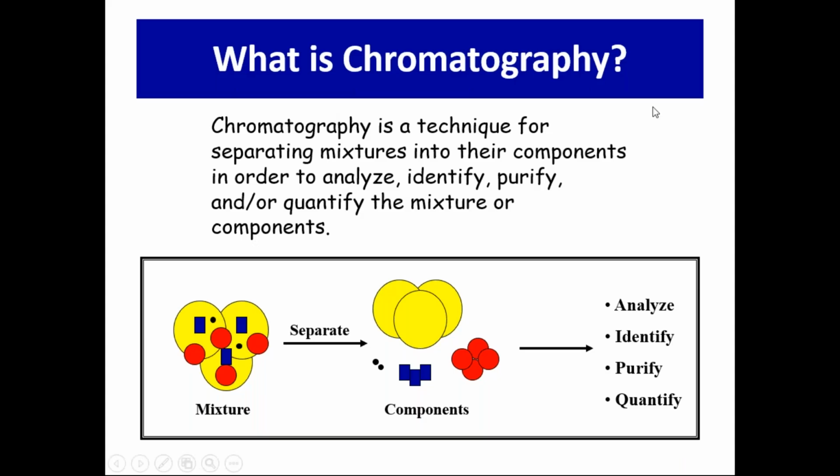So, what is chromatography? It is a technique commonly used in laboratories to separate mixtures of compounds into their components. And once we have separated them into their components, we can analyze them, identify them, further purify them, and also quantify them.